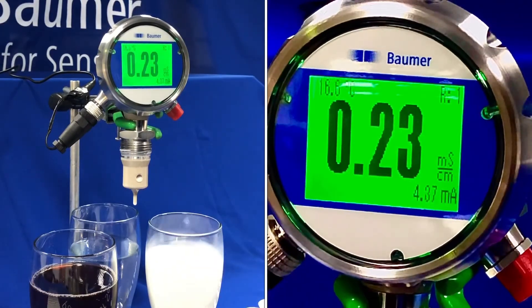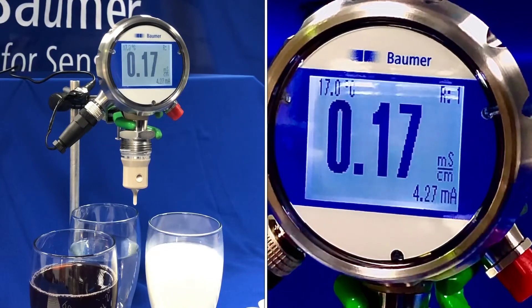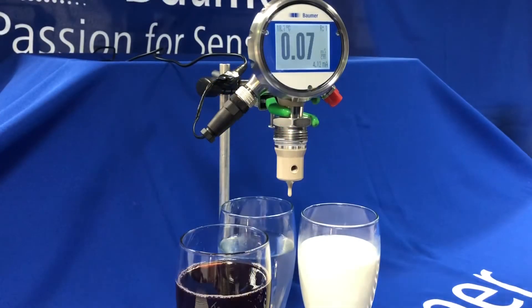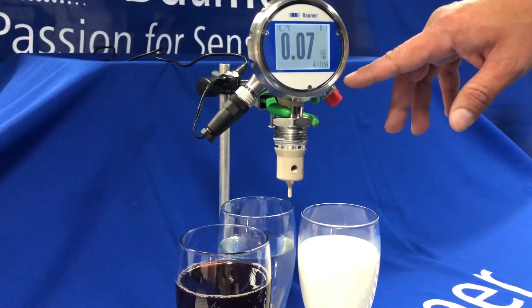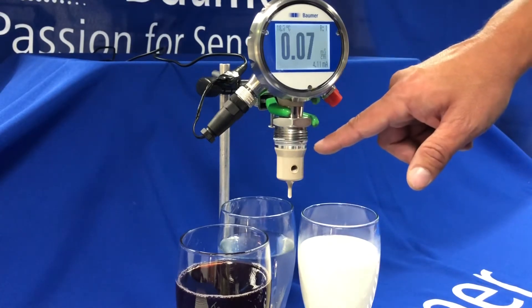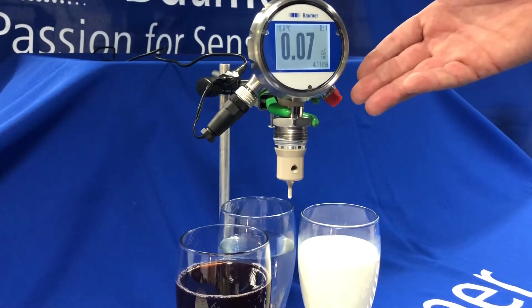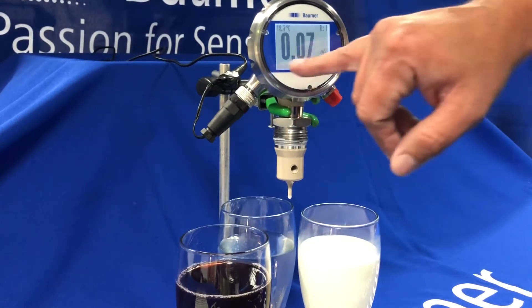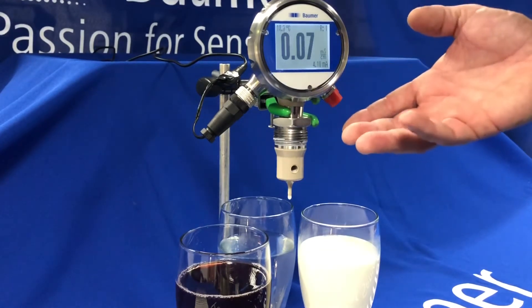That's just a quick demonstration of some of the smart features of our conductivity sensor and DFON display. To summarise: this is our AFI-4 conductivity sensor. We also have a remote version called the AFI-5. The display makes it easy to view phase separation changes, and we can put labels on the screen to show what media is in the pipe at any one time in any CIP system.